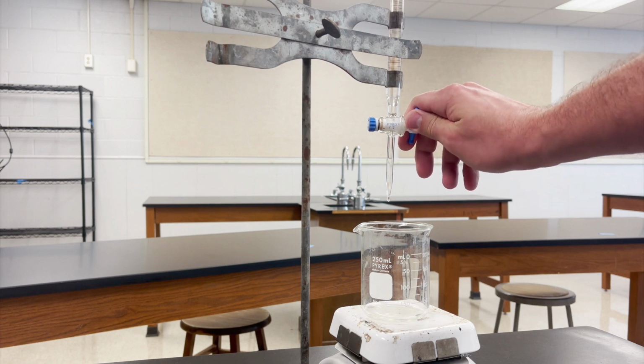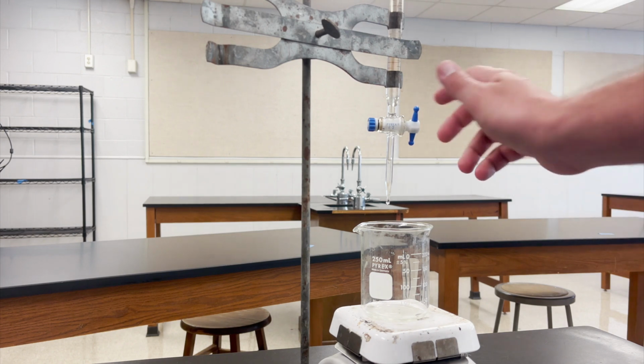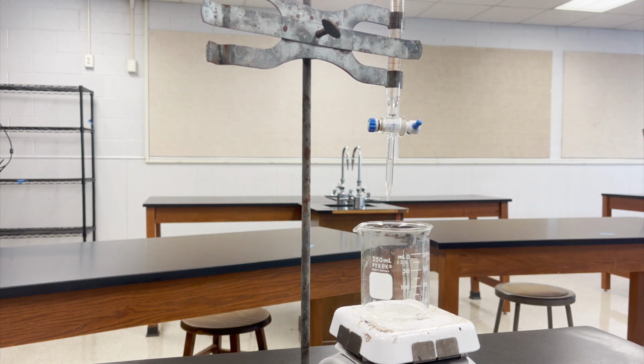And you can also get it to where, if you do it just right, it comes out in drops. You can put in one drop at a time to get really, really close to the endpoint, so you can control how much comes out. You can have it full blown open, or just drop by drop.